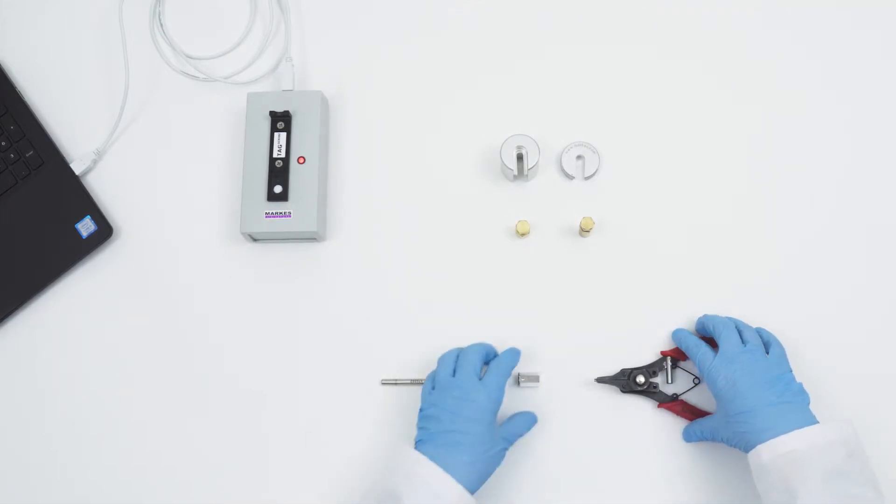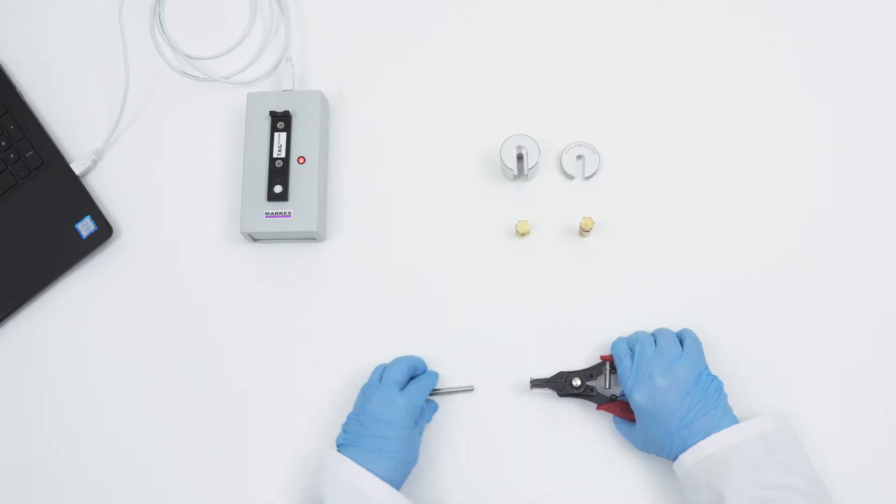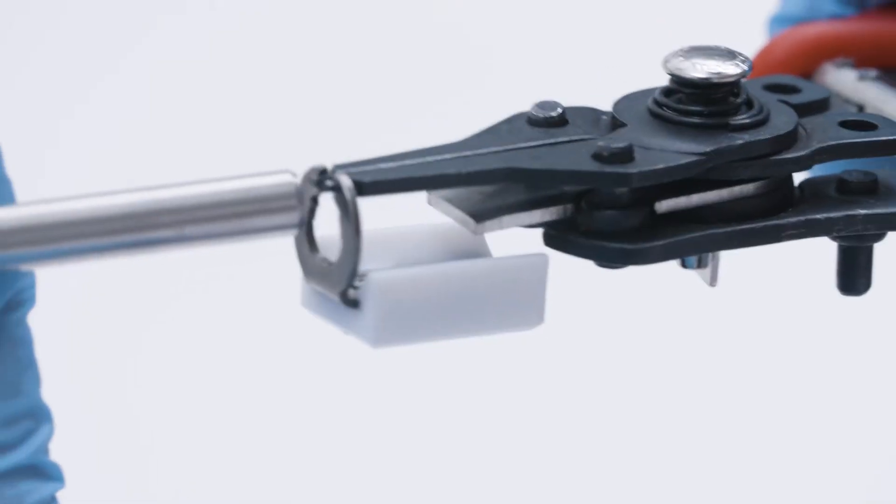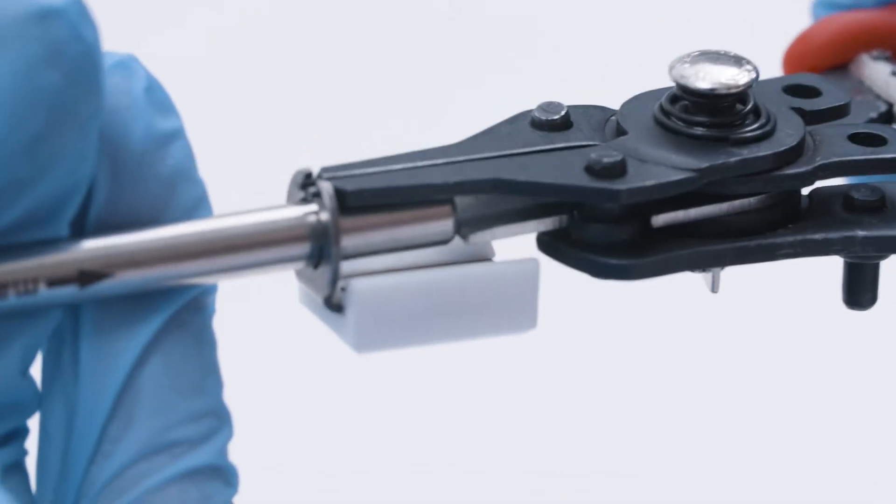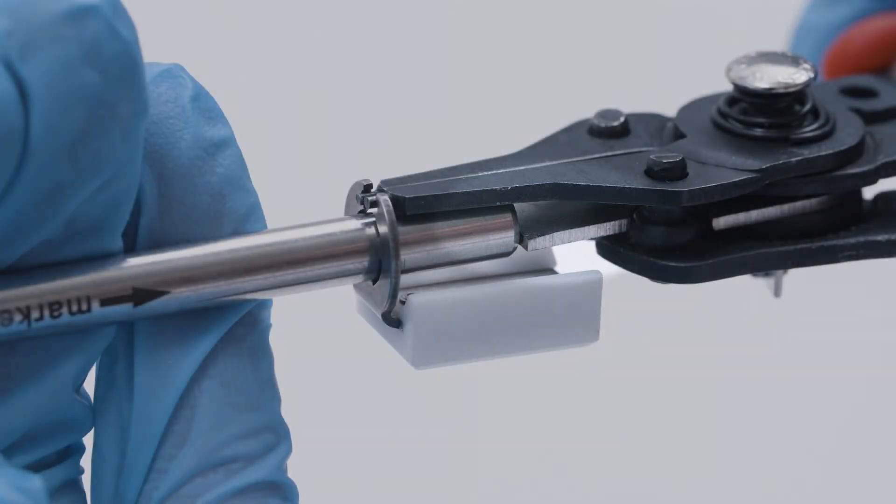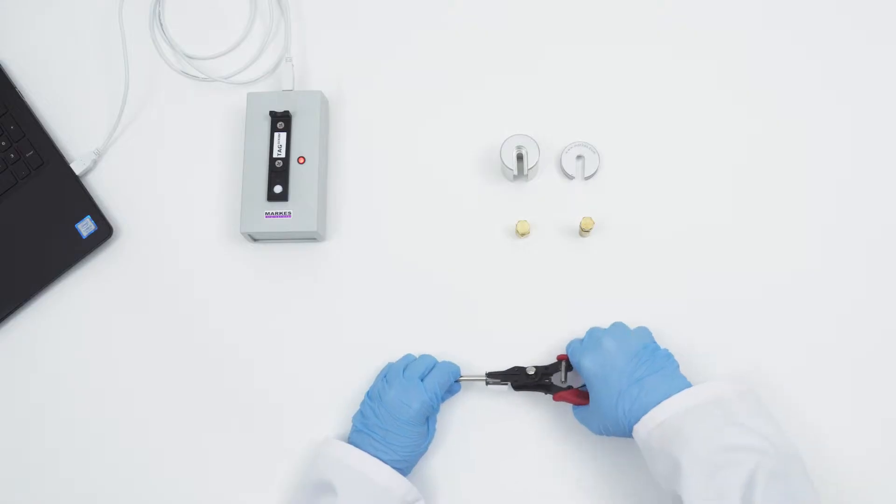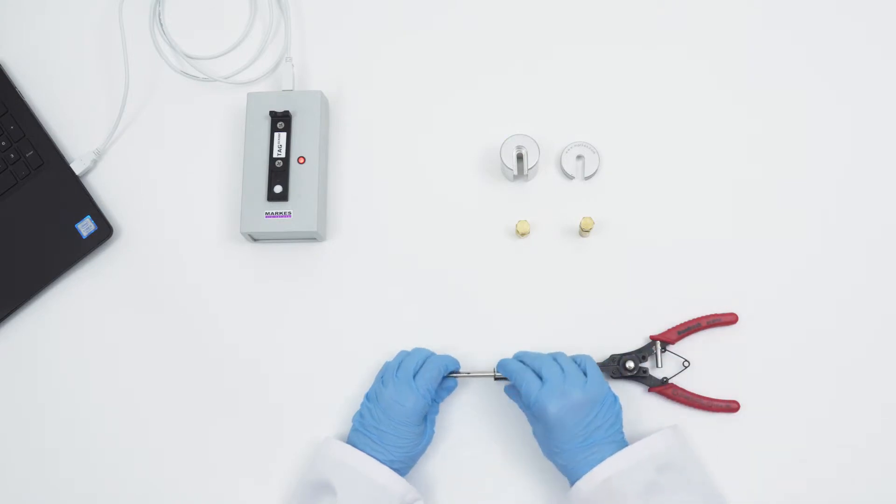To begin, slide the tip of the tag removal tool into the tag clip. Be sure to hold the TubeTag fixing removal tool with the metal stop facing the inside of the tag. Squeeze the handles of the tool tightly while sliding into position on the non-sampling end of the tube. Note, the metal stop on the tool will prevent the tag from being pushed on too far. Once the metal stop is in contact with the tube, stop squeezing the handles. Your tag is correctly placed.